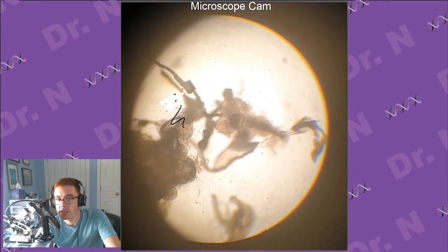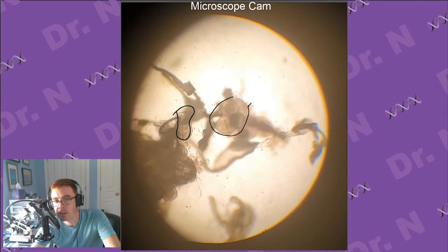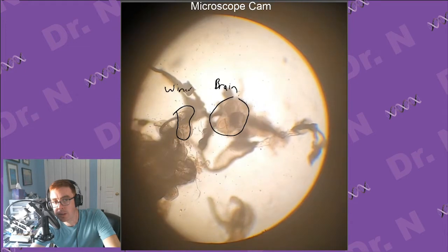Let's get rid of this. And of course that erases the background. Cool. Oh, no, it doesn't. Okay. So right about here is one organ, and then here it's kind of hidden now because it's moved around a little bit. This is the brain. Not at all what I'm looking for, but I found it. And this is something called a wing disc. So I'm just going to put wing.